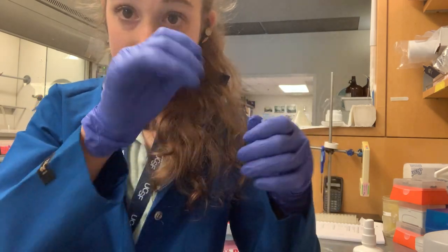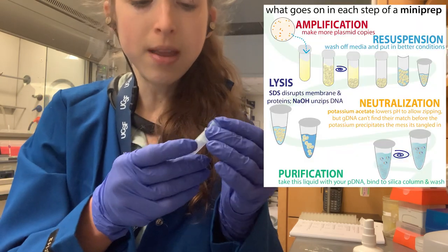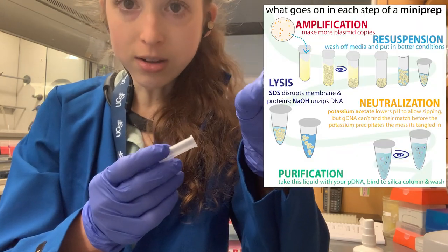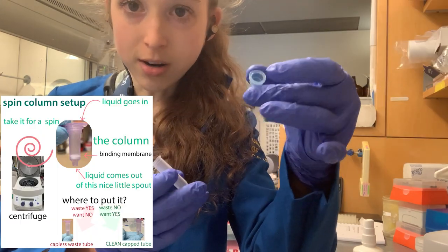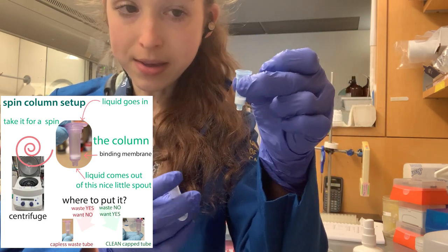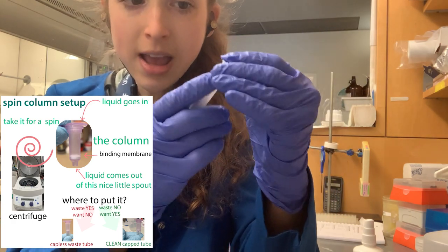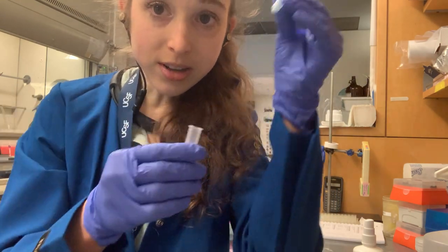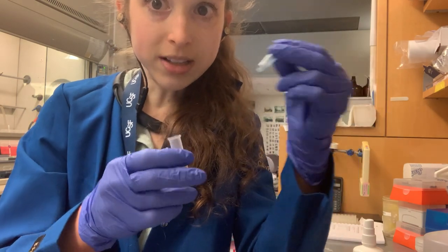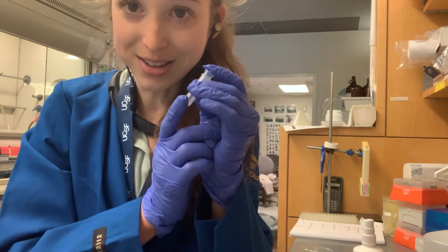Speaking of things where you have to leave the cap open — one of those is a later step of a mini prep. When you're doing a mini prep, or similar things like a PCR purification — a column-based method — you have these little columns that you stick in an outer tube, and you label the outer tube. When you take the columns out, you may need to pour off whatever's in there, and you need to make sure you put the right column back in the right tube.